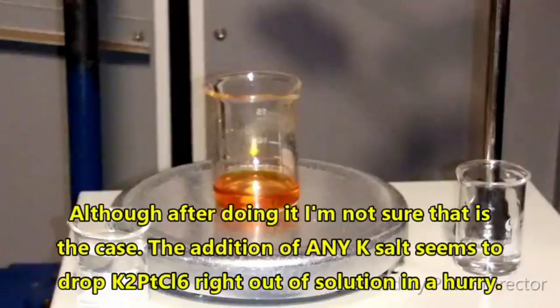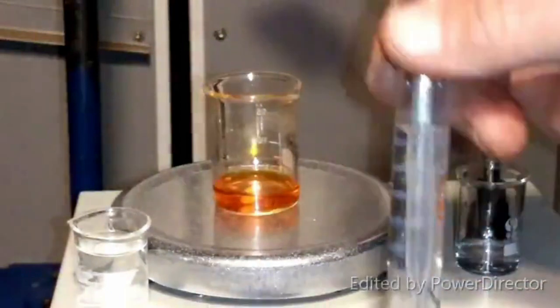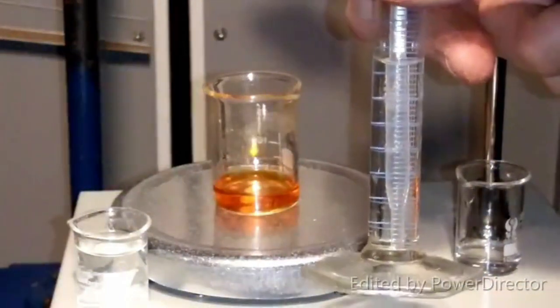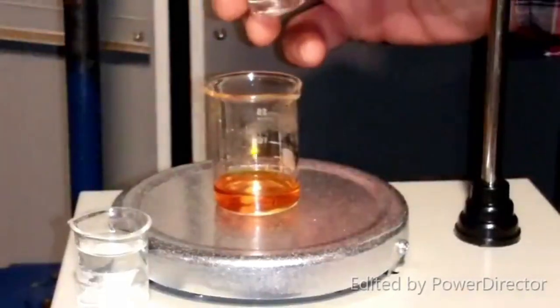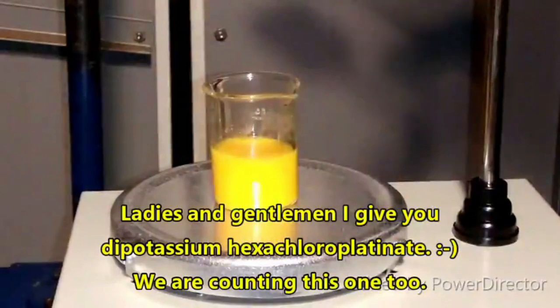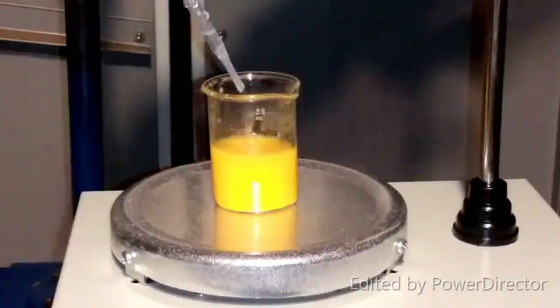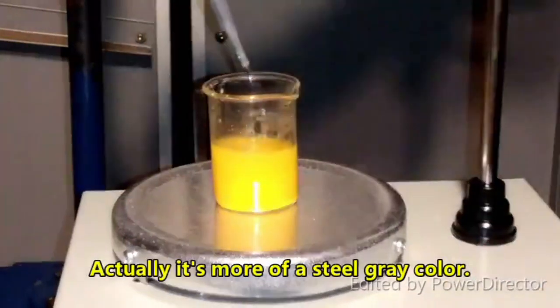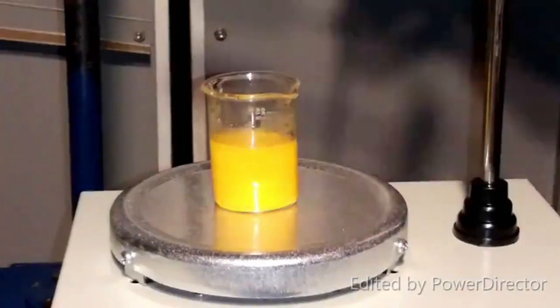So what we need to do is add all of this to our hexachloroplatinic acid. Then we are going to reduce it using 1.5 mL of a 3.7% formaldehyde solution. So fingers crossed, people. Let's hope this works. This one takes the most stuff going into it out of anything I've done. Okay. All right. 1.5 mL. This is supposed to be a black compound. Okay. A little bit of excess formaldehyde just to make sure I've got enough.